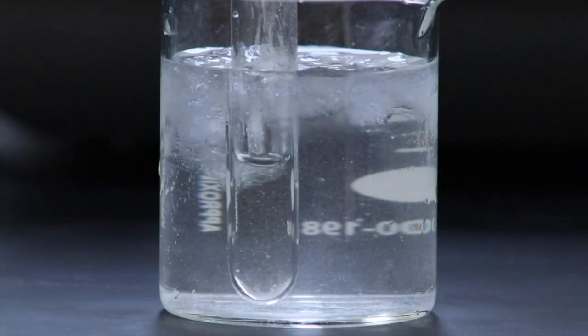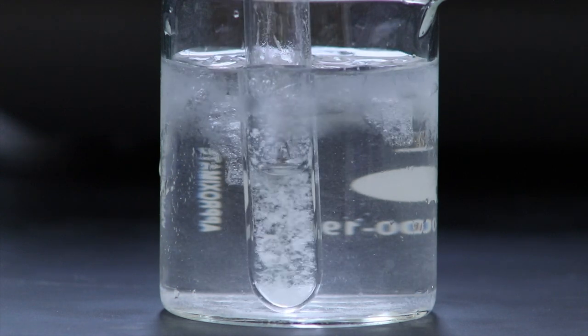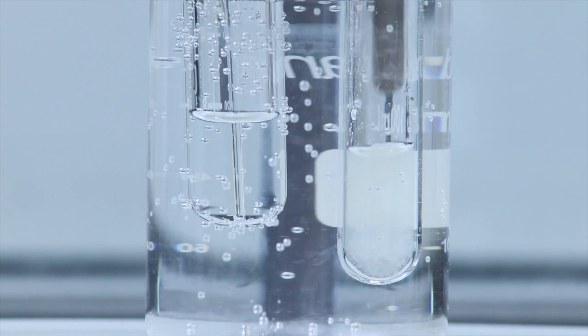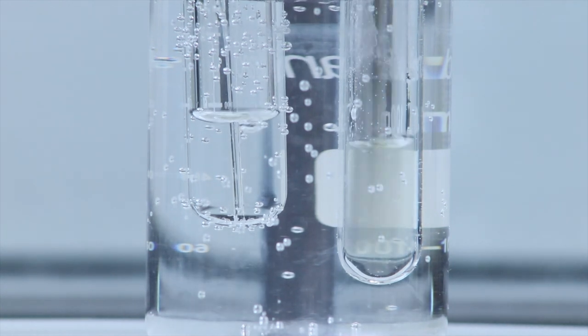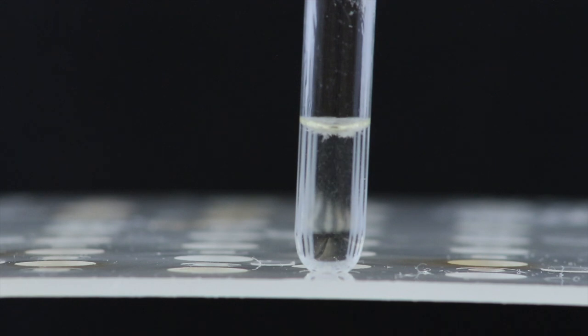And then I'll place the Craig tube in an ice bath just to make sure that the solid can come out of solution. And then I'll redissolve the solid in the hot water bath and leave the tube on a rack so that the product can recrystallize slowly at room temperature.